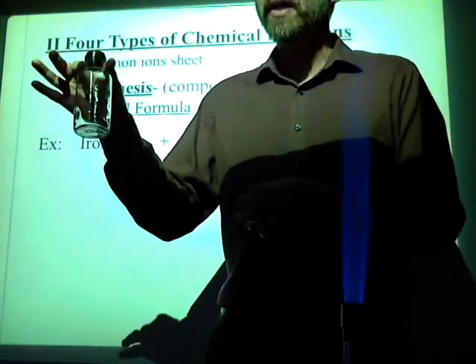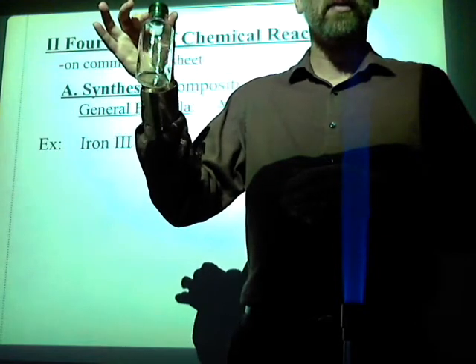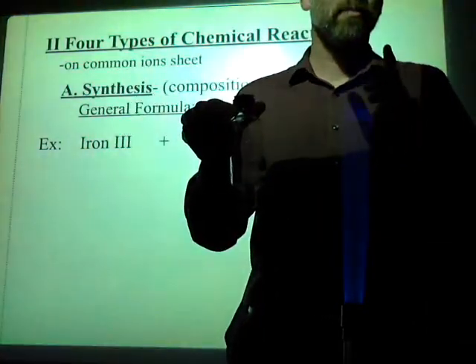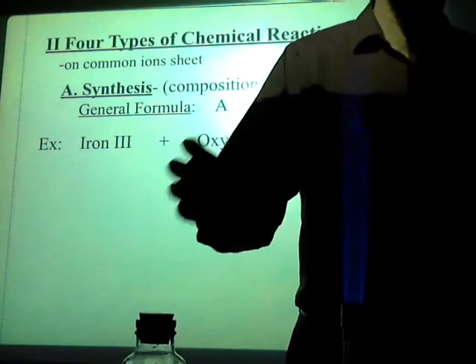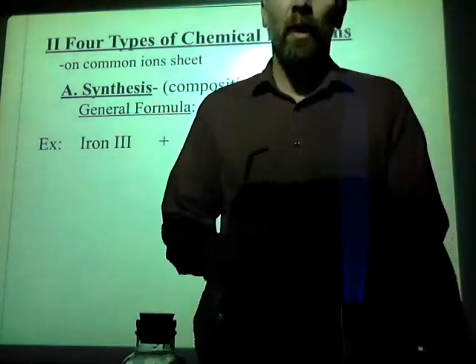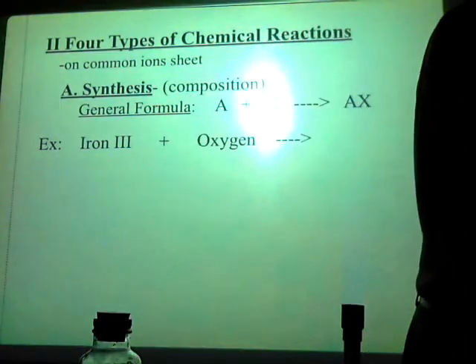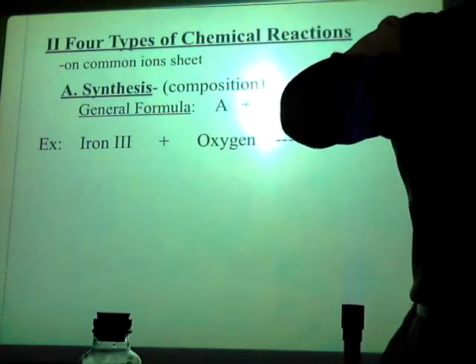All right. I have in here a bottle. What do you think that is? Not air. Oxygen. I'll show you how I made it after I do the little demo. I have a bottle of some pure oxygen in here. So we're going to kick it up an even bigger notch when I combine iron and oxygen together.